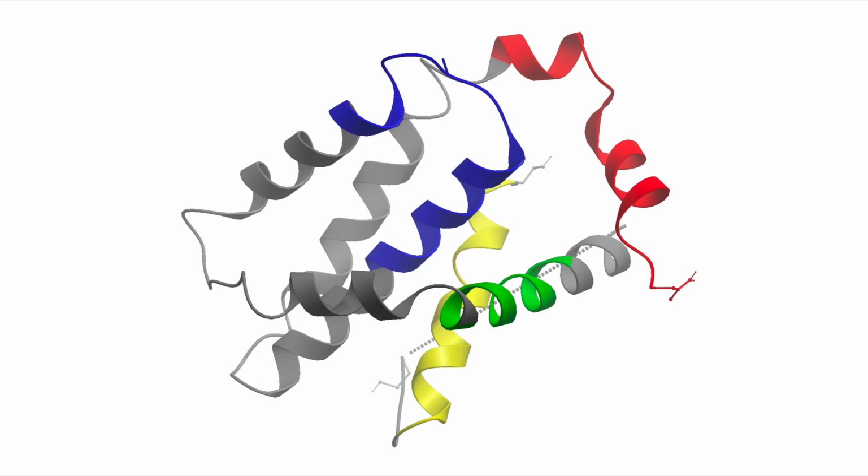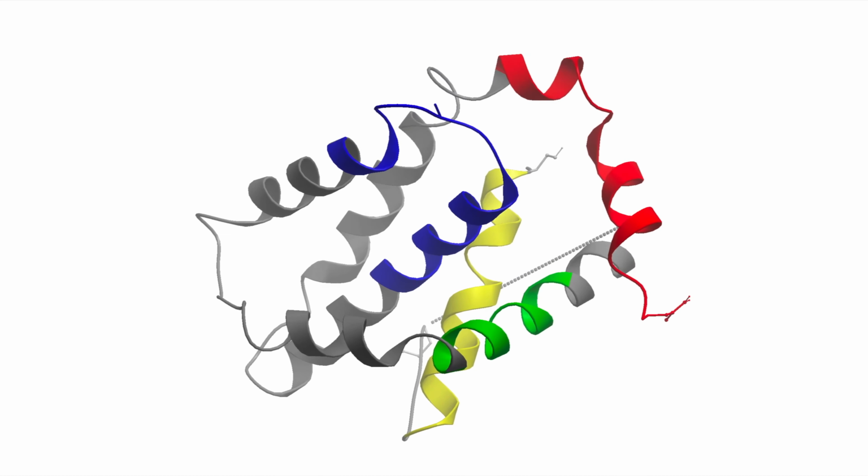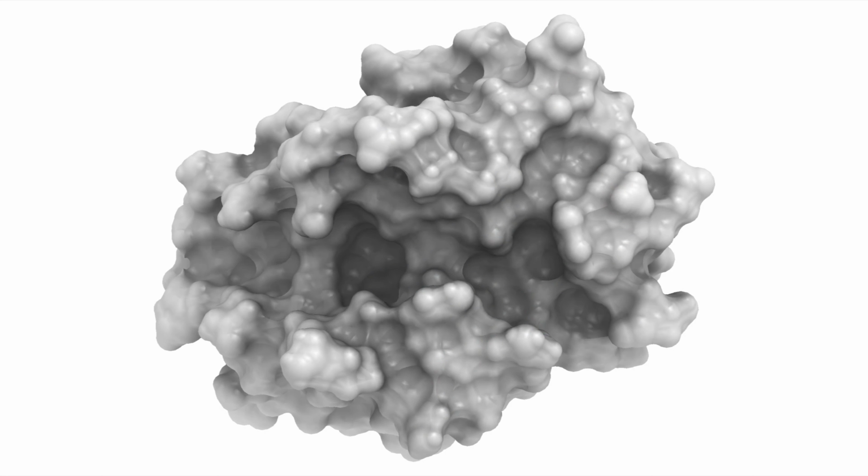To guide hit optimization, analysis of the Bcl-xL binding pocket architecture was conducted. As previously mentioned, the BH1 to 3 domains form the Bcl-xL binding pocket. It is a long and shallow hydrophobic groove composed of 4 hydrophobic pockets, P1 to P4. Using ICM Pocket Finder to identify ligand binding sites, P2 shown in green and P4 shown in blue make up a substantial amount of the groove's volume.